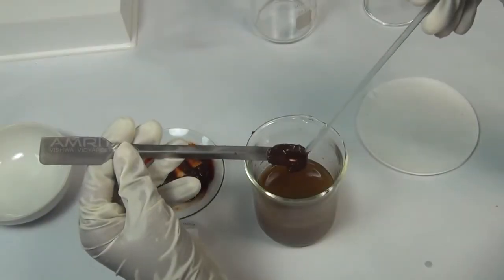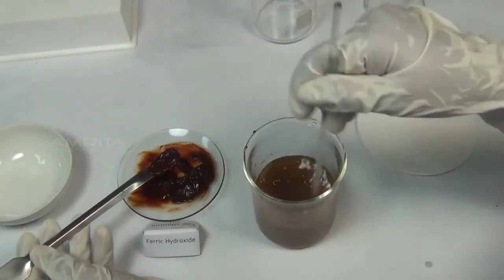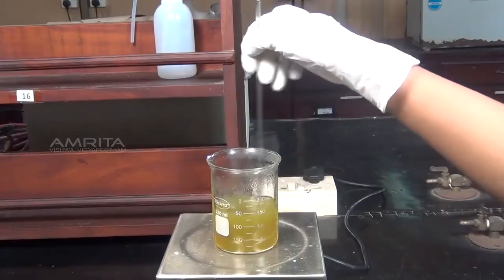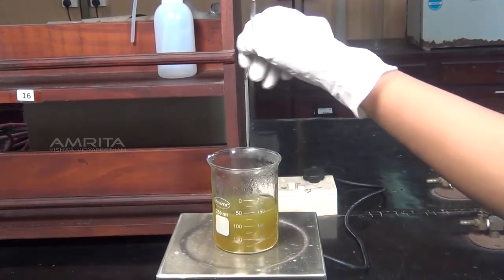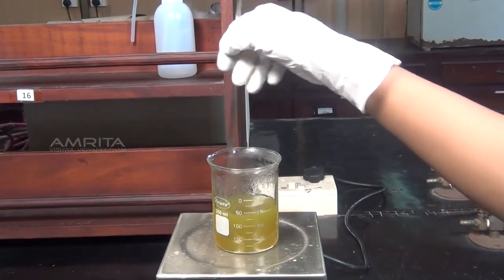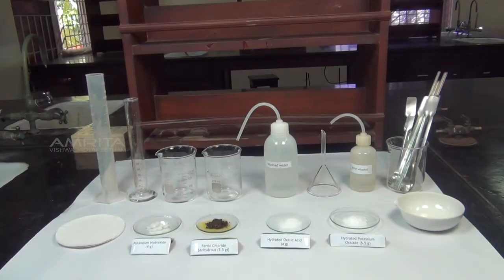This complex can be prepared by dissolving freshly prepared ferric hydroxide in a solution of potassium oxalate and oxalic acid. Our aim here is to prepare a pure sample of potassium trioxalatoferrate-3.